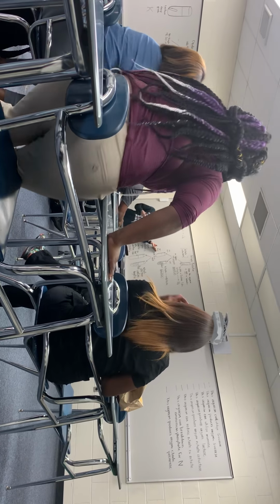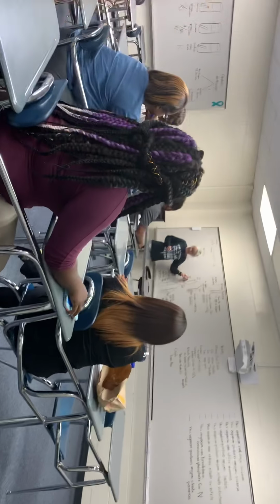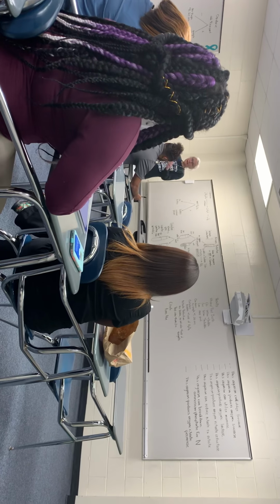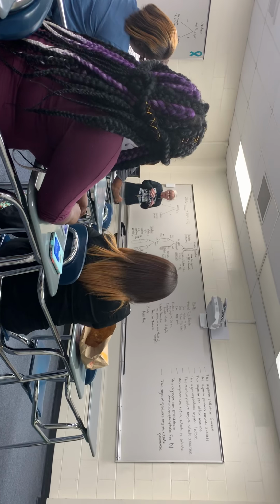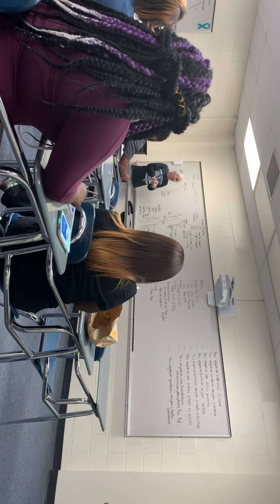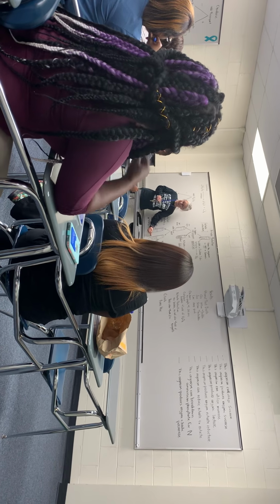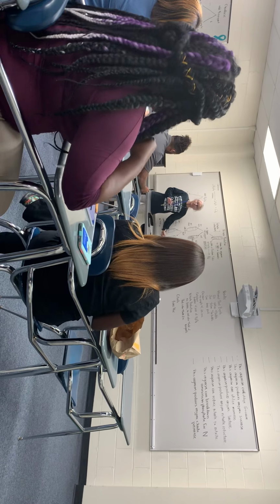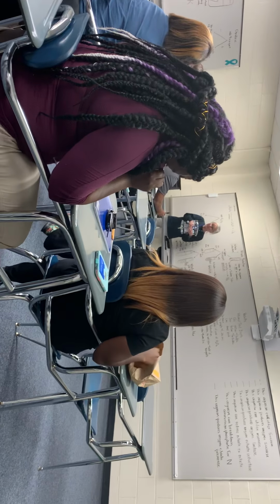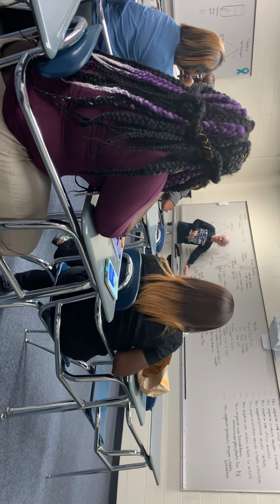If you don't get the red color when you add the two reagents, you still can't say that's a negative because it could be converted into some other nitrogen-based compound. So that's when we did that last step. We added the zinc dust. Y'all remember that last step? Okay. If you add the zinc dust and then it turns red, okay, that tells you the nitrate is still in there. The zinc dust reacts with the nitrate to give you that red color. So that confirms a negative test.